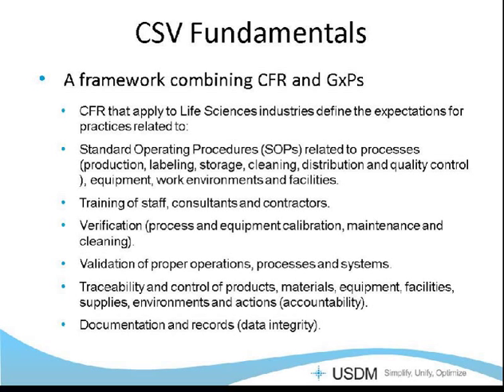Your staff needs to be trained. They need adequate training in order to perform their intended jobs, and that includes consultants and contractors that you bring in. Process and equipment calibration, maintenance and cleaning or verification activities: the CFRs call out for that specifically. The operations, processes, and systems must be validated to show that they're fit for their intended use.